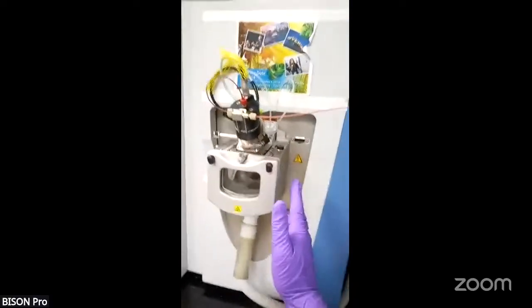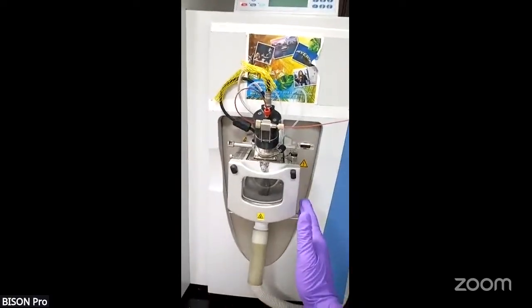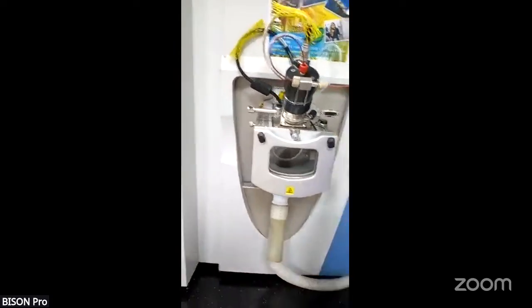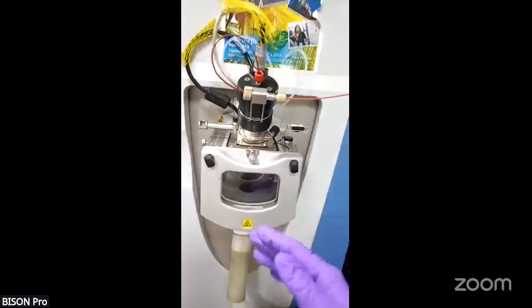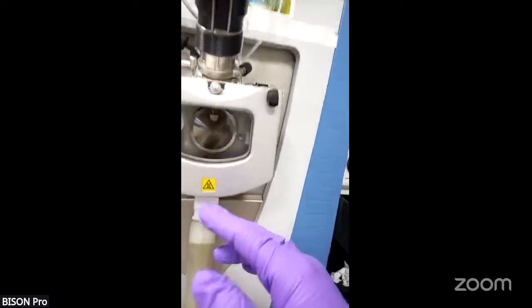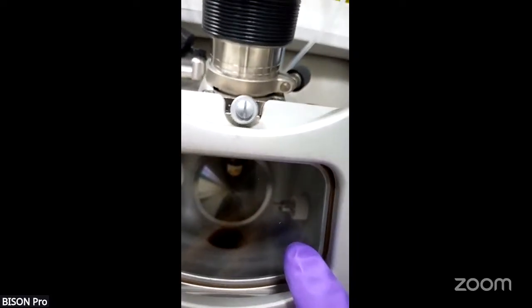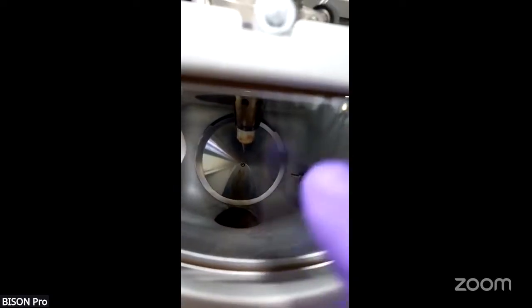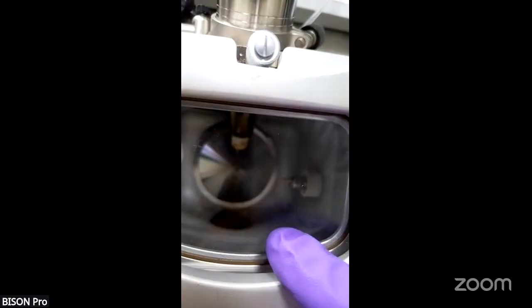What we showed earlier is the nano LC source, but this is a HESI source, which is connected to the HPLC. Once the samples are injected into the HESI source, you can see the cone inside. The sample travels through it. The samples get injected through this cone, and the sample acquisition happens in the mass spec.